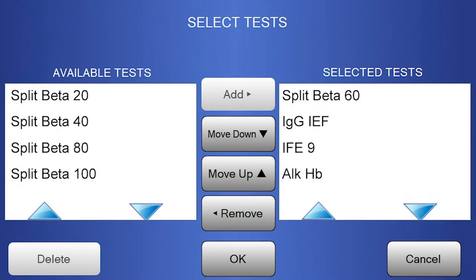The Spiffy Touch has a broad menu of assays available. Methods include serum protein and urine protein, both 5 and 6 band, in configurations of 10, 20, 40, 60, 80, and 100 samples per gel.